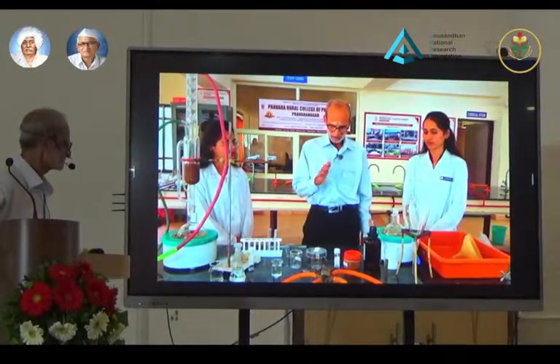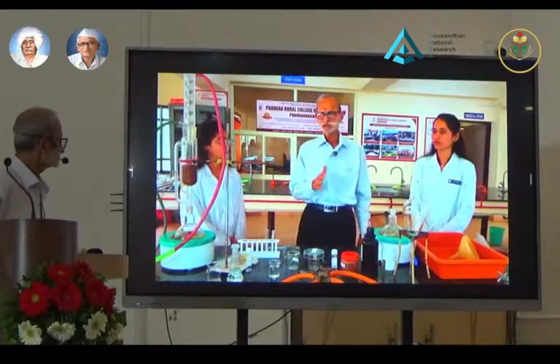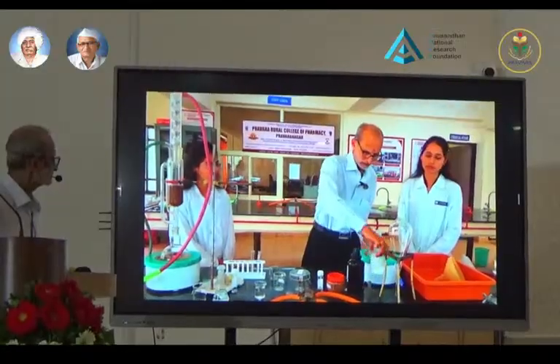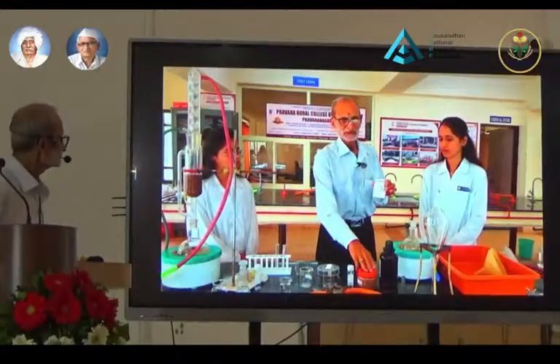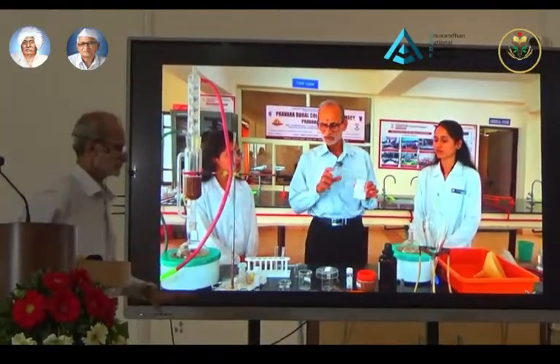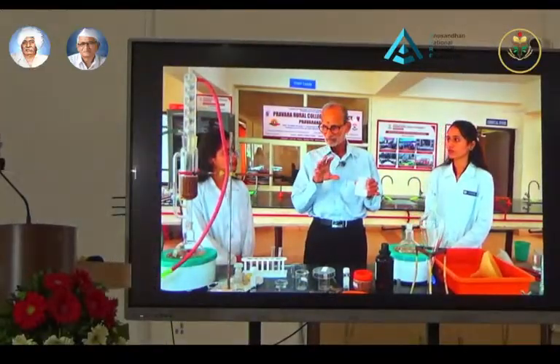Now, in the plant, it is present in the form of a salt, and those are normally hydrophilic. So what we are going to do is treat this with an alkali. Here I have calcium hydroxide, which is an alkali. We will impregnate this powder with the calcium hydroxide, and then keep it for half an hour so that the calcium hydroxide goes into the cell.